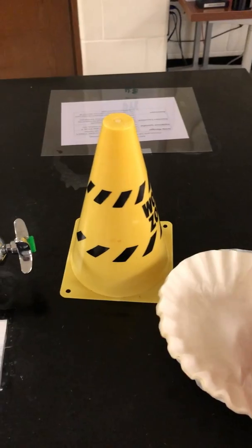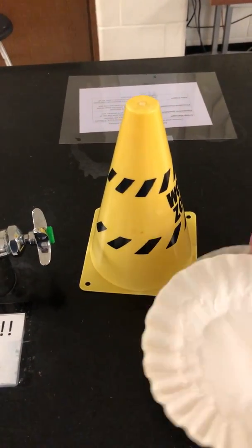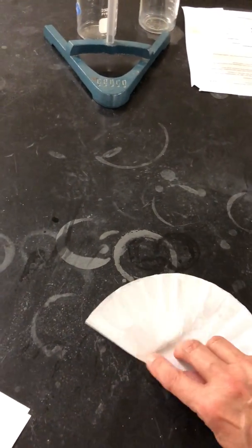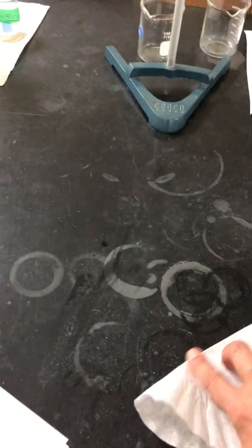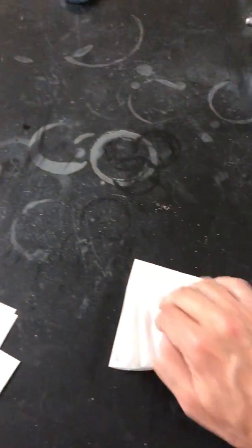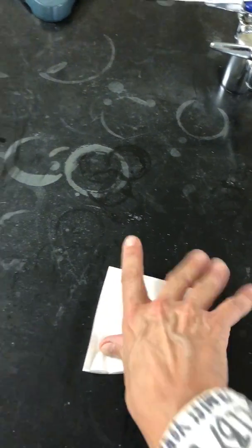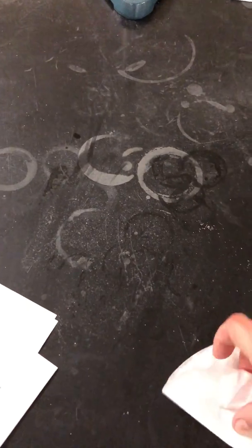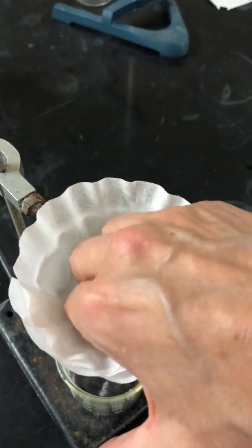Here we go. Good. All right, here's a neat little trick that you want to learn for when you filter. I'm sorry. Fold it hot dog. Sorry, I'm doing this all one-handed by myself. Fold it hamburger. Pull open one side. Okay, it'll fit nicely into your filtration system.